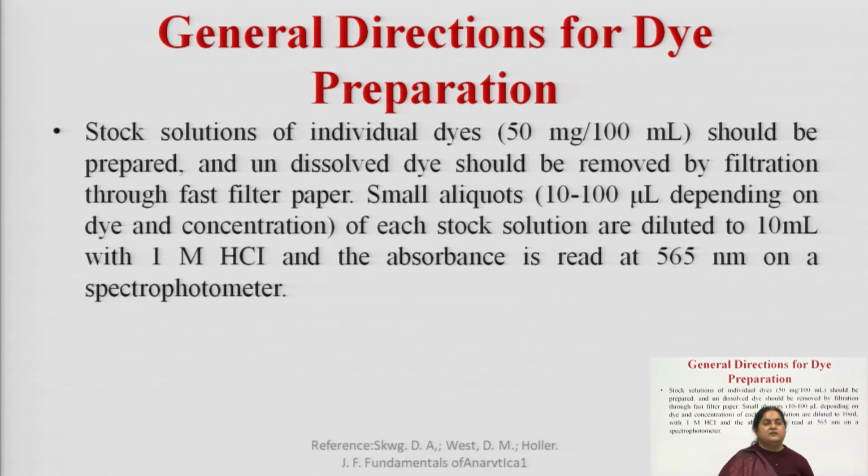Next is the general directions for dye preparation. So, how will you prepare the dye? You have the 4 components. It is the same procedure that you follow for making the stock solutions of the drug whose spectrophotometric UV evaluation you have to carry out.